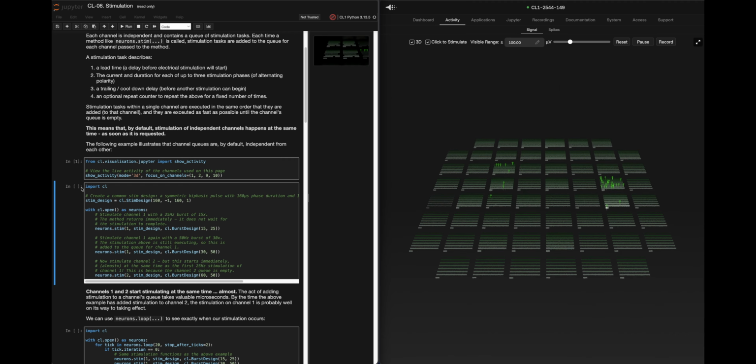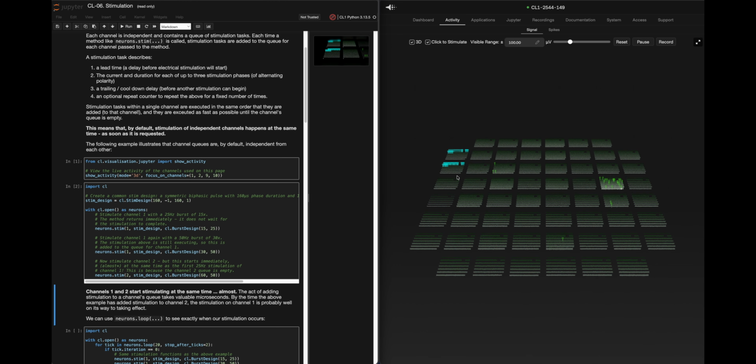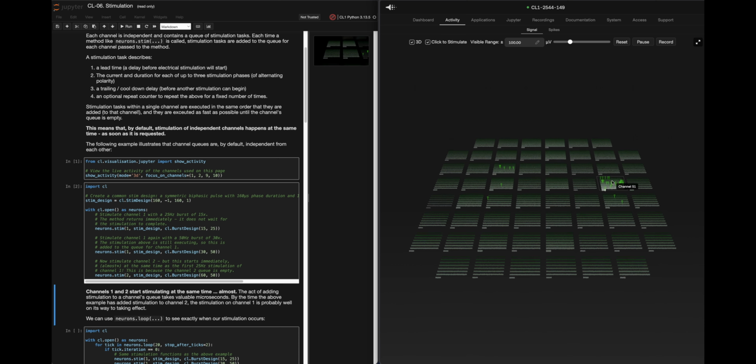So we'll go ahead and run this cell and you'll see it just goes, brrr, you have a ton of stimulations there. I would not recommend doing this on an active channel, on a stimulation that has that quick of a burst. I have used that for spike suppression.